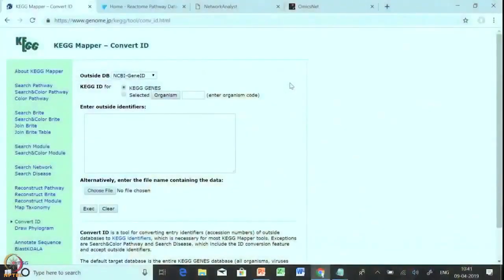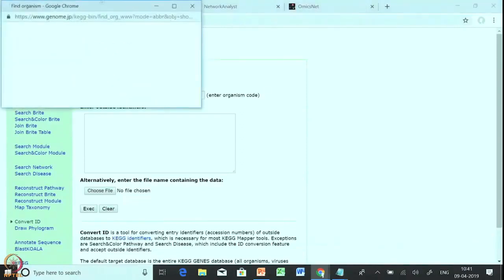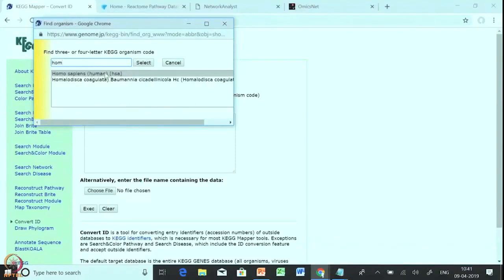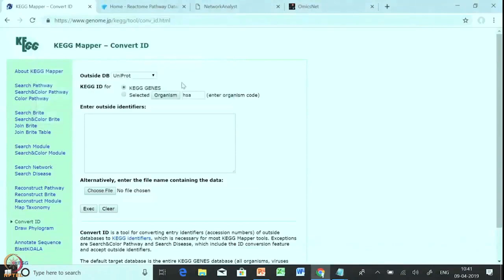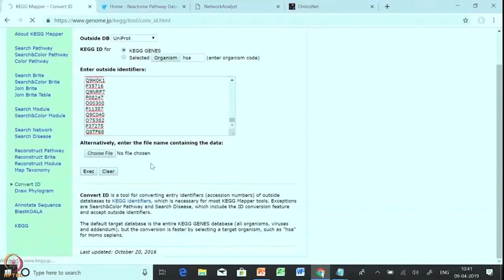This is the home page of KEGG Mapper Convert ID. In the first 'outside DB' field you can choose what kind of ID you are putting — NCBI gene ID, NCBI protein ID, or UniProt ID. As I have given a list of UniProt IDs, I will be selecting UniProt ID. The next important thing is the organism — you write the name of the organism, and as I have taken the file from a Homo sapiens repository, I will select Homo sapiens, and it shows here as HSA. In the 'enter outside identifier' box we will copy-paste the list of UniProt gene IDs, then click the execute button. It will take a little time and give you the complete converted ID from UniProt to KEGG ID.